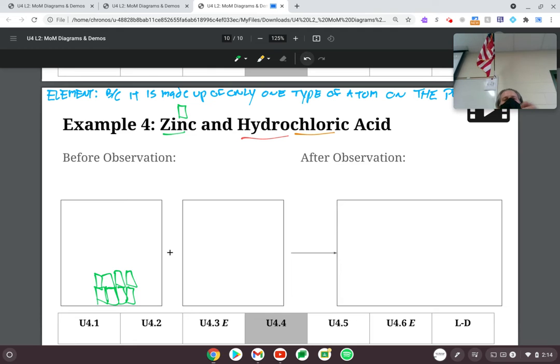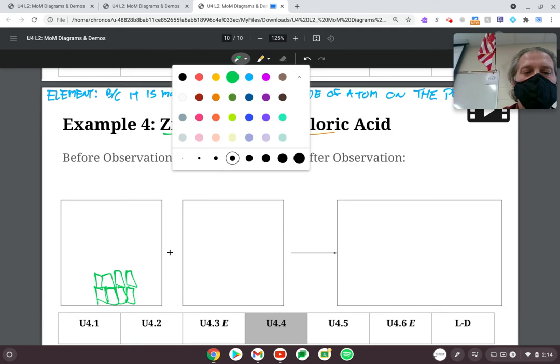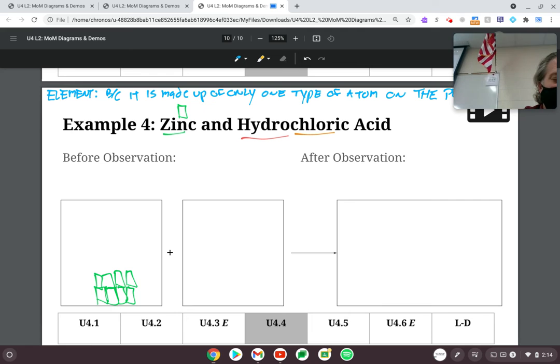And the observations that we had made, I heard a lot of people saying it was a solid. What else? What other observations did you make? We would say maybe gray, less than silver, but we'd say gray. Oh, he said it looked like the texture of a crayon. So there is some chalkiness. So it's gray, white, chalky.